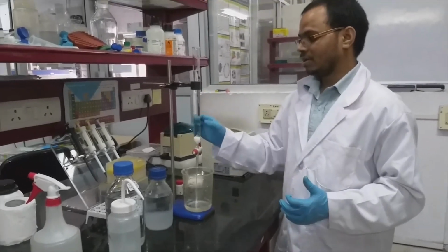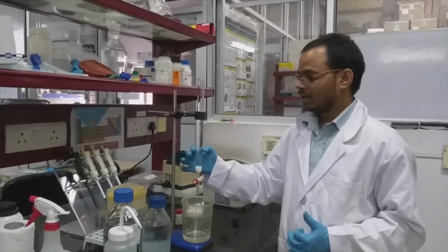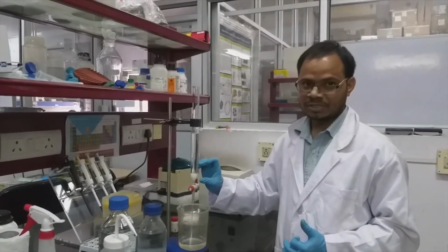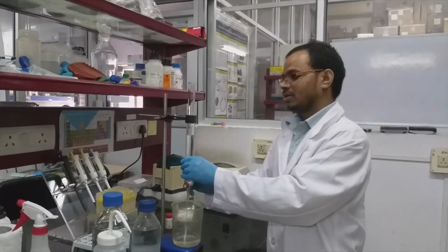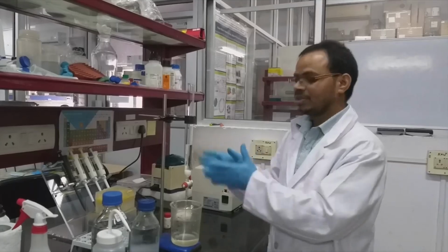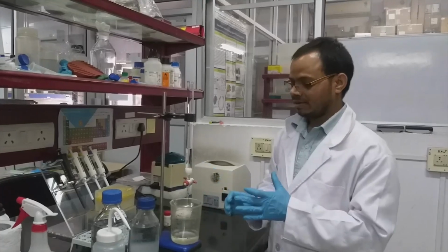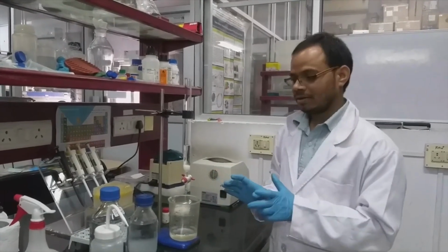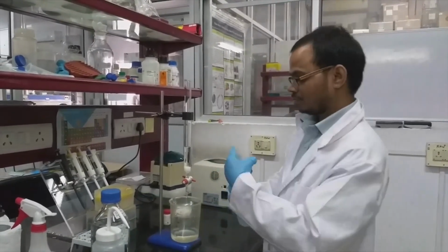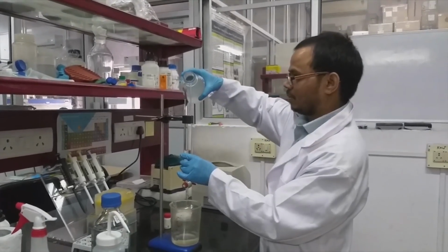Once the soaking in the sodium phosphate buffer is over, we have to keep at least 1/4 of buffer in the column itself. Then we will load the beads. You cannot load complete beads directly because it may disturb the column packing. So we will load the beads and let them settle by the influence of gravity. So these are the beads. Just I'm going to add the beads.